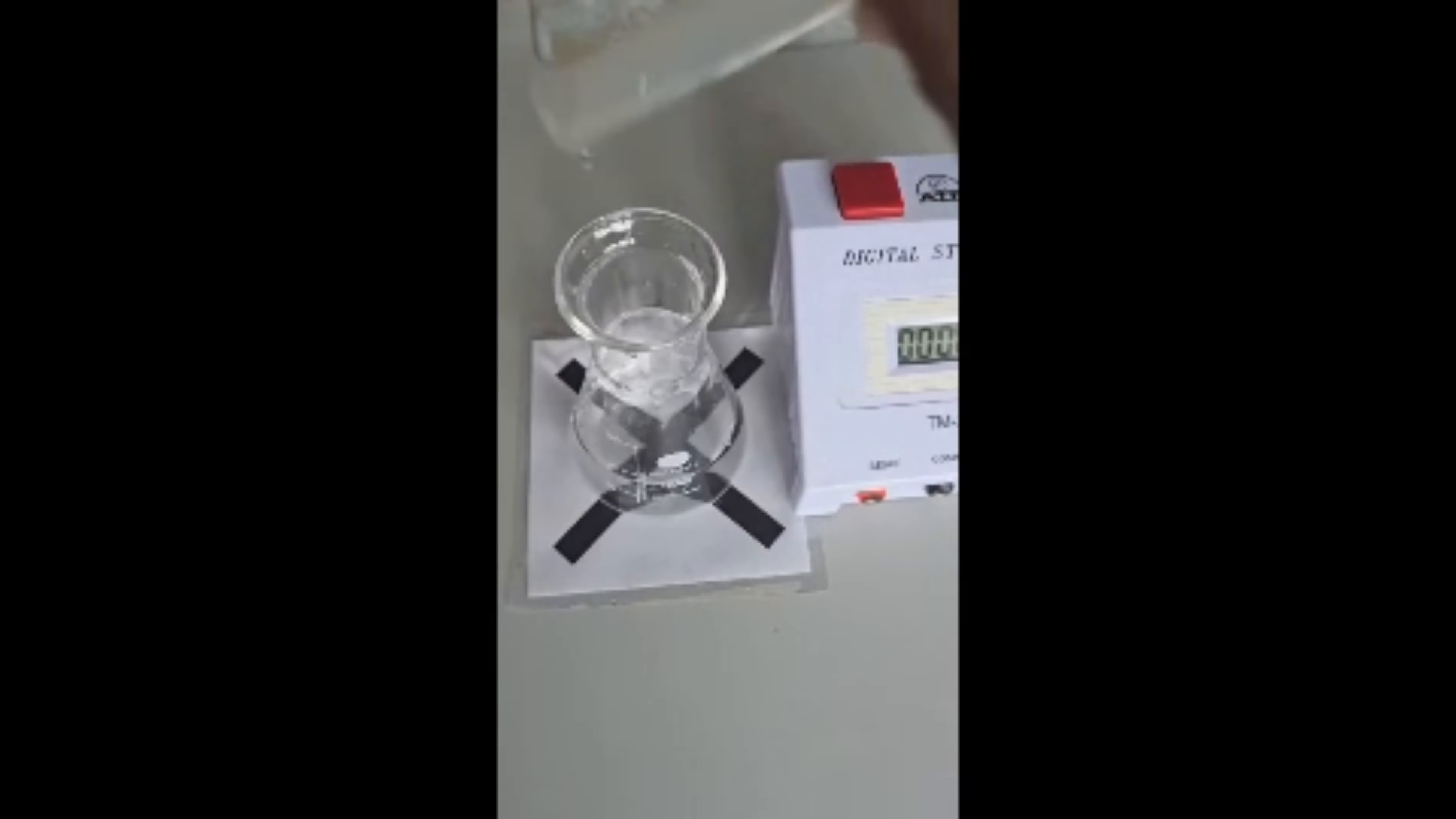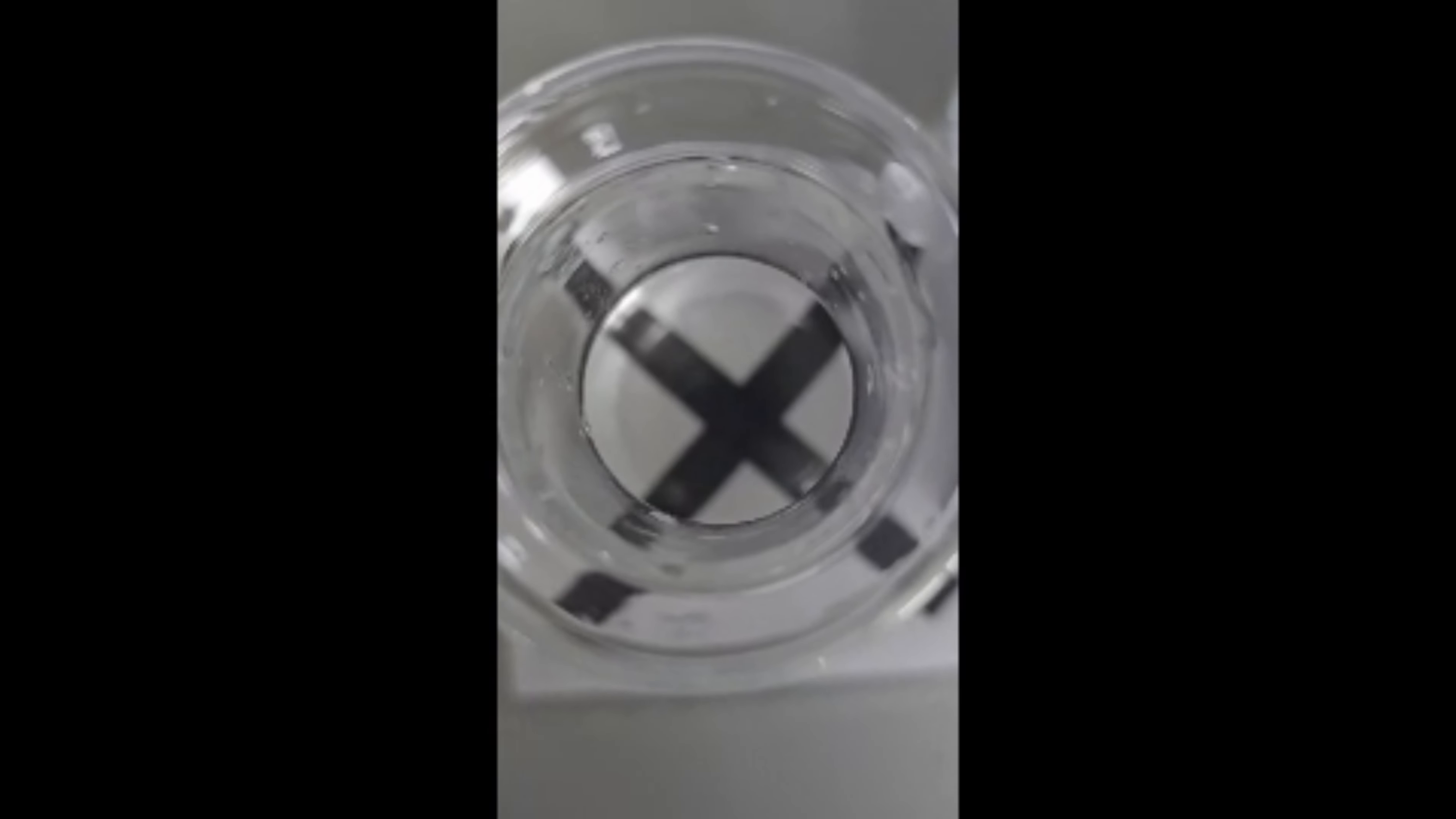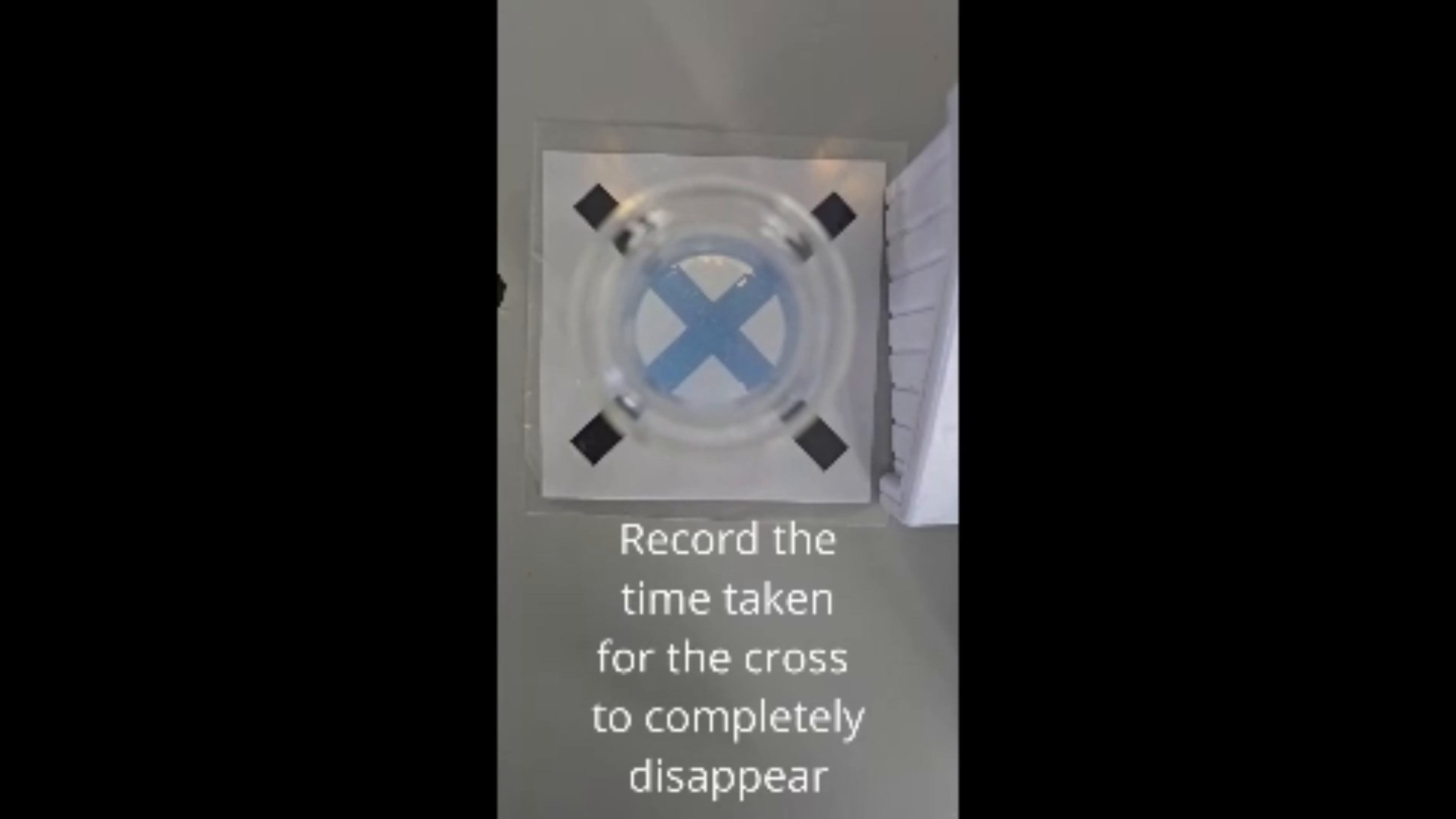Place an X and place the conical flask on top of the X. Get your stop clock ready and transfer the hydrochloric acid quickly, pressing the stop clock. You must watch over the conical flask until you see the X completely disappear.